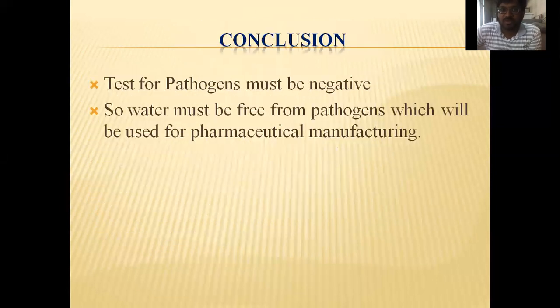What will be the conclusion after these four organisms? All tests should, or must, be negative, meaning no pathogens allowed in water. So water that will be used for pharmaceutical manufacturing must be free from pathogens.